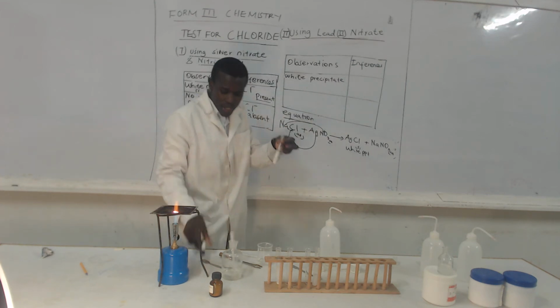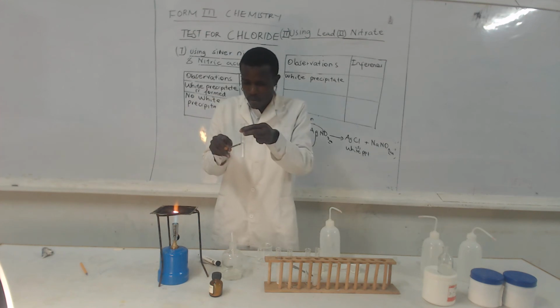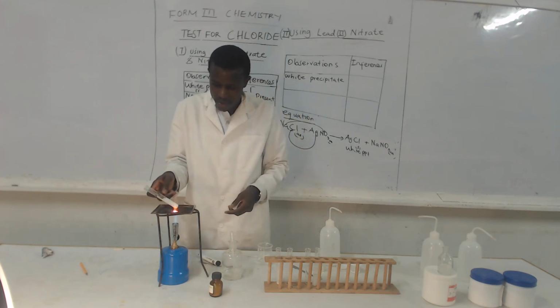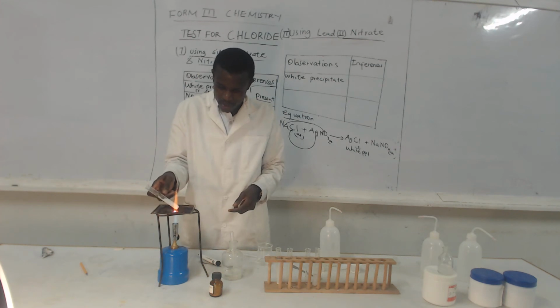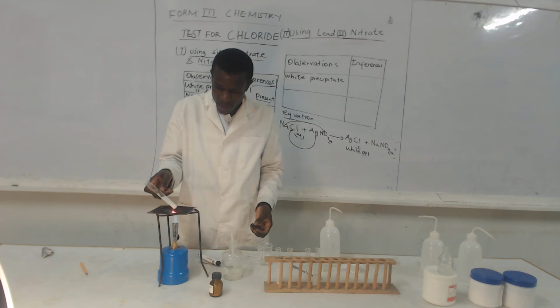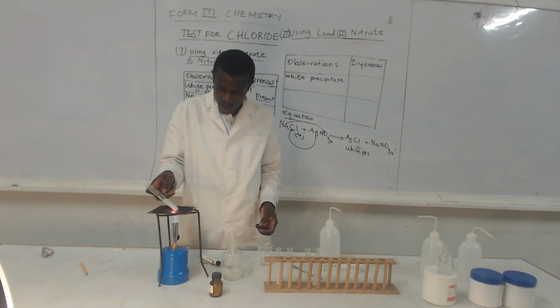What would happen if we warm it? Students, be very keen. What would actually happen when we warm this?